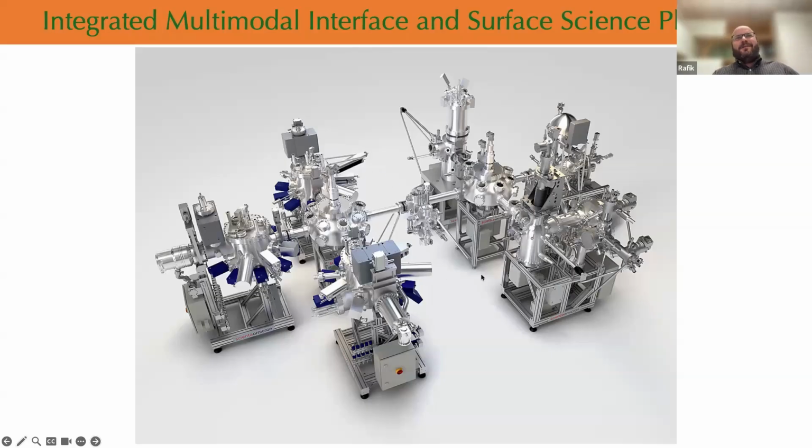So this one is a kind of surface science tool dream, where you can have one side where you can do deposition of materials, and the other side is the analysis tool. Especially for this one, those are 3 different MBEs, but you can have an MBE with CVD, with an ALD, even connected to a glove box. This is the load lock. And here you have a low temperature STM, and here you have an XPS chamber. And this side, this one was designed to have an HREELS here.